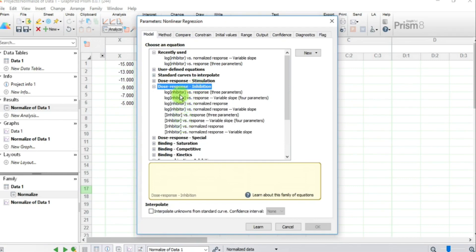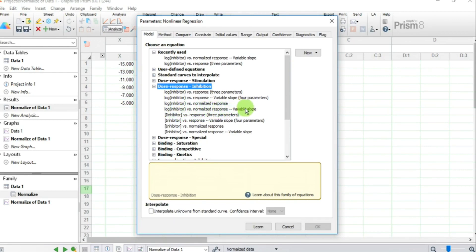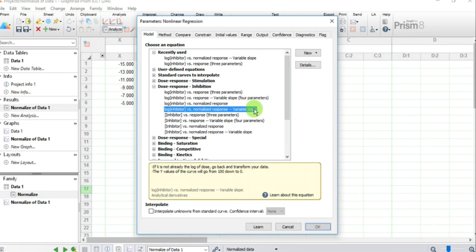You will see different parameters to select according to your experiment. We have log inhibitor doses versus normalized response, so choose that option since the Y values have been normalized. Select the variable slope model.